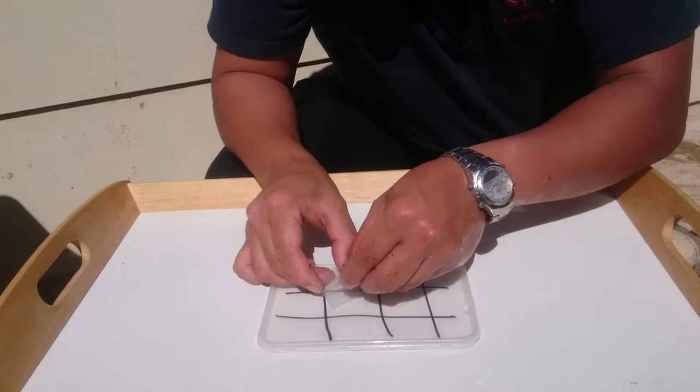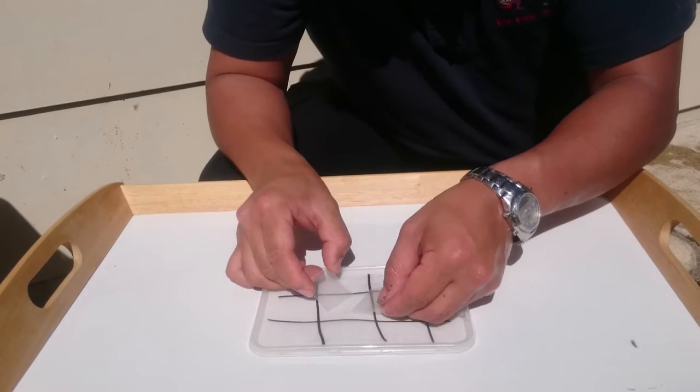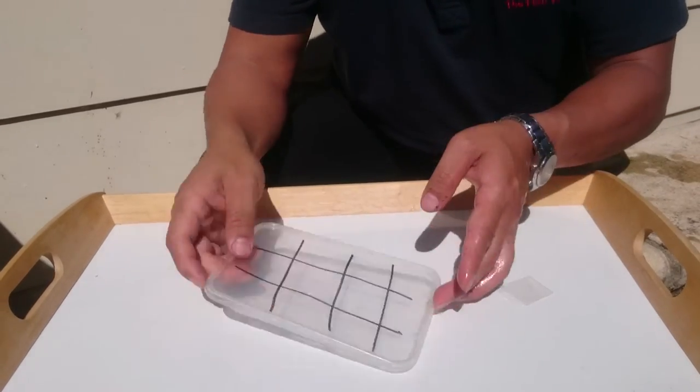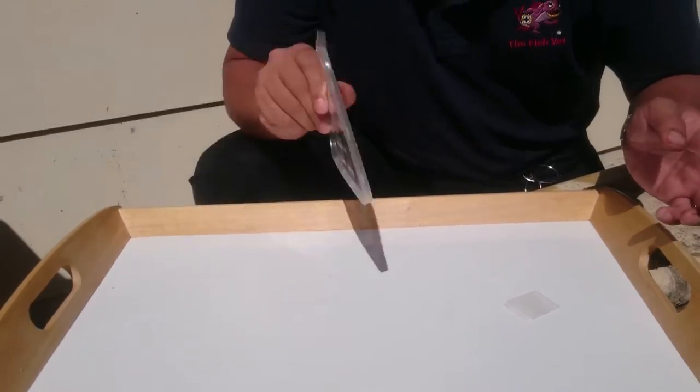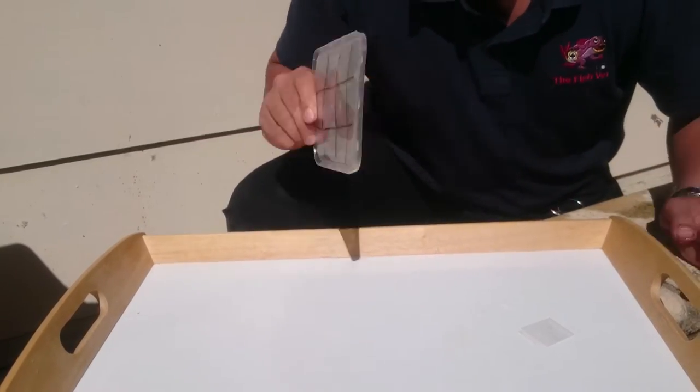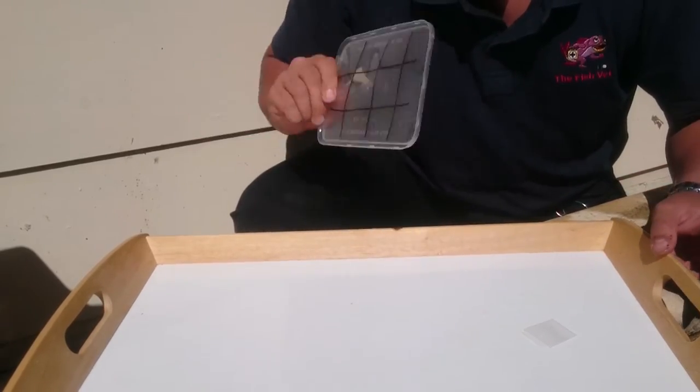Now, just transfer the mucus onto the brick, and you just have to flap it, making sure that it's completely dry before you take the next sample to apply to the next area.